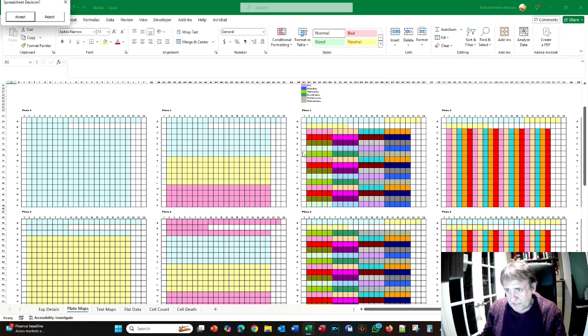Now, there are 16 rows in the plate, so that worked when the controls are in the columns. However, when the controls are in the rows, because the controls themselves take up 2 rows, we now only have 14 rows to fit the samples. So because we set the subplating area as 15 rows, that is obviously greater than 14 rows, so the 15 is just ignored and all the rows are used.